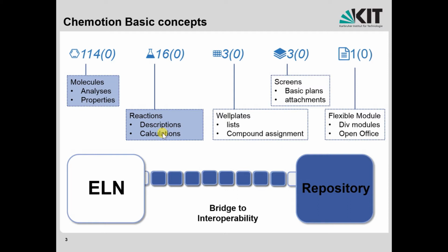Beyond that, the ELN offers other entities, so beyond molecules and reactions, there are well plates, screens, and the more flexible module research plans available. The screens and well plates are included for biological investigations. Research plan covers most of the other functions that can be described by more generic applications. In conclusion, the repository supports the transfer of data associated with chemical functions and chemical work, but further disciplines are not yet covered, and that will hopefully come soon.